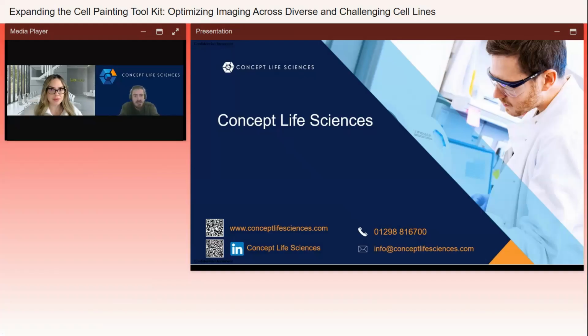All of the PCAs and the UMAPs have been generated from underlying data. So a lot of the images that I've shown in the presentations are the pseudo color composites, and they are essentially just pretty pictures. They can be altered to show whatever you want.